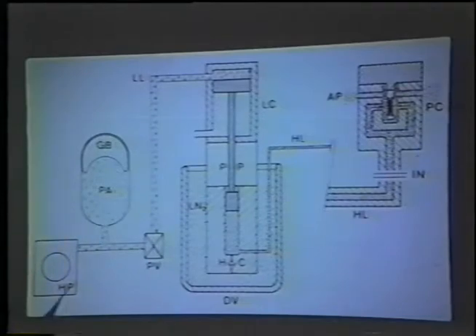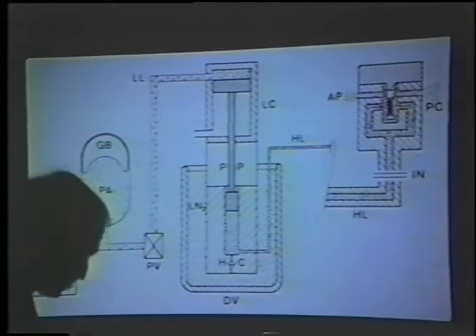So we redesigned the sample carrier so that one fit over the top of the other like a tight-fitting cap, except for one channel through which the pressure could get in. You had to have that there because if the caps were too tight, the sample would not be pressurized and freezing would be lousy. And we also bolstered the sample holder so that both sides were the same thickness and they couldn't spring apart as much. Under those conditions, we were able to keep distilled water between the hats. So that was an improvement right there. Let's go on to the next slide.